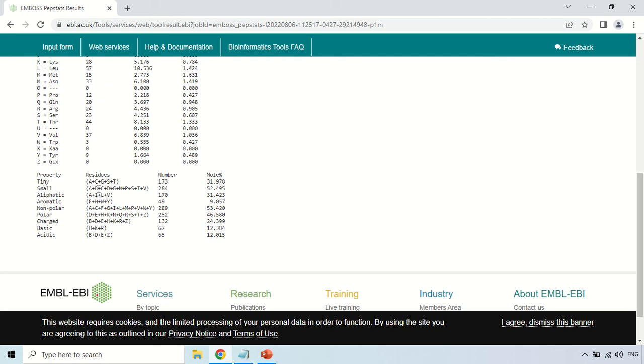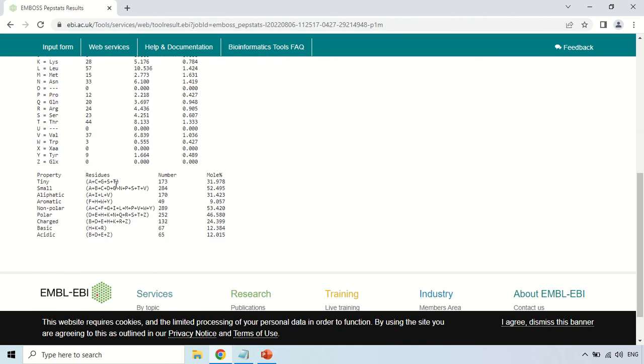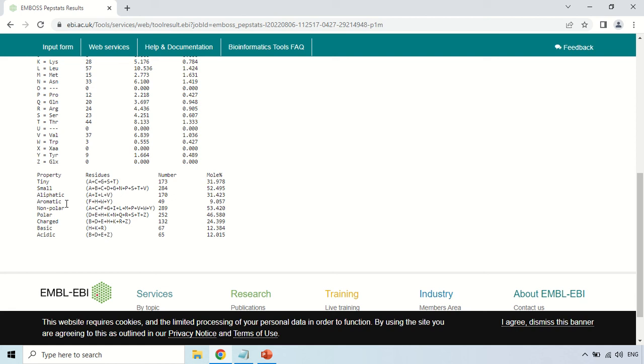This is the one letter code classification and you can see their full name in this table. Here these are the one letter and three letter codes. Like A for alanine, so by this you can see these codes in this table. How many aliphatic amino acids are there? There are 170 aliphatic amino acids.